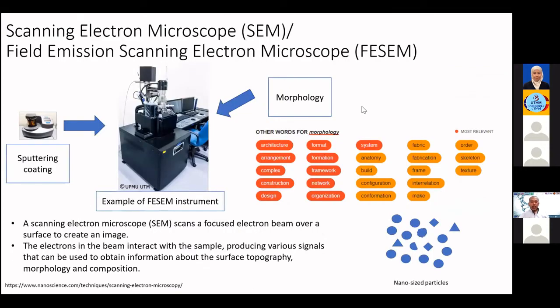Okay, I want to go to the FESEM. This is actually the most widely used characterization technique, because from FESEM, from SEM, from TEM, we can see the picture. We take a picture of the material. Most universities and most agencies have FESEM, SEM, to take a small picture, because it's quite interesting, right? Take a picture and then you put it in the thesis. So we can see the picture of this material.